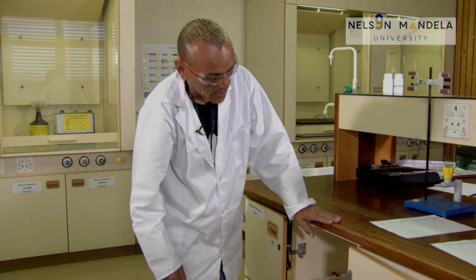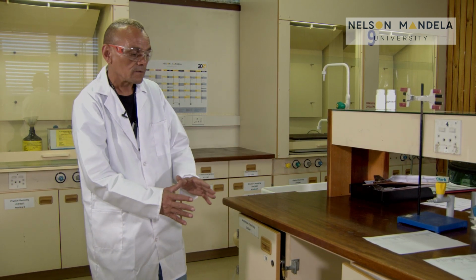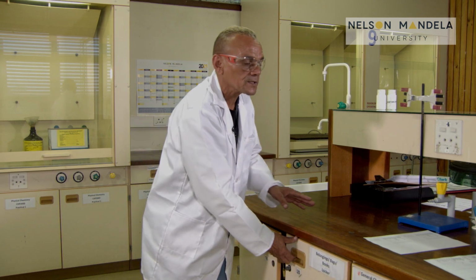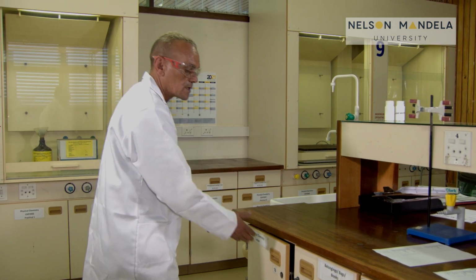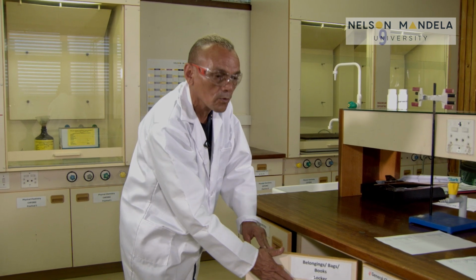Whenever you come into the lab, it will always be empty, because that is where you are going to put your bag, your books, and whatever things you're not going to use inside the lab with your experiments. You're going to leave it inside there. That is a safety precaution to make sure that your benches are not cluttered. There's nothing on the floor, there's nothing on the sides. So very important, each one of you should have an empty belongings, bags and books locker available for you at each of these sessions.